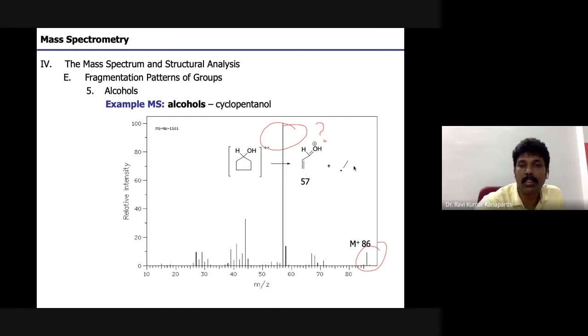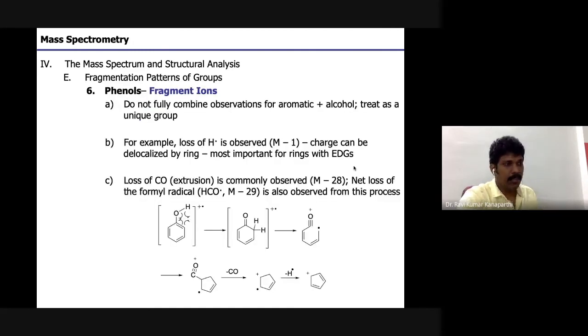So please remember that. And phenols are cyclic compounds, and this is a very drastic difference between phenols and alcohols. Alcohols do not give an M minus 1 peak, but phenols give an M minus 1 peak. Previously, I mentioned that alkynes, terminal alkynes especially, readily undergo hydrogen radical elimination, and the corresponding M minus 1 peak can be observed.